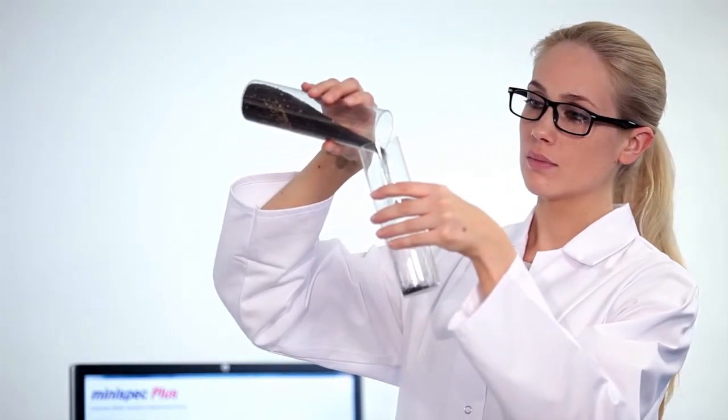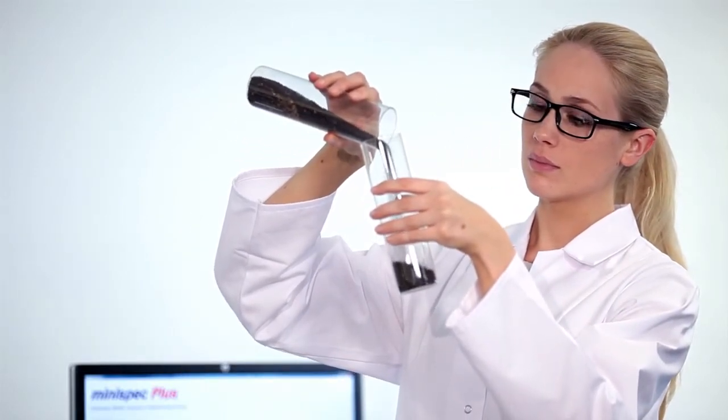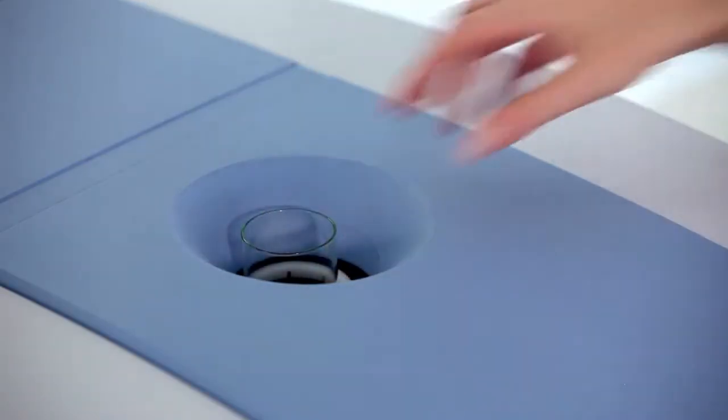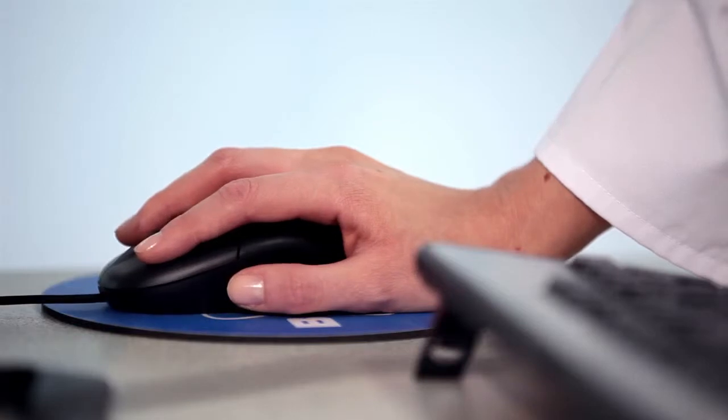Bruker's minispec seed analyzers offer fast, accurate, and non-destructive measurements.